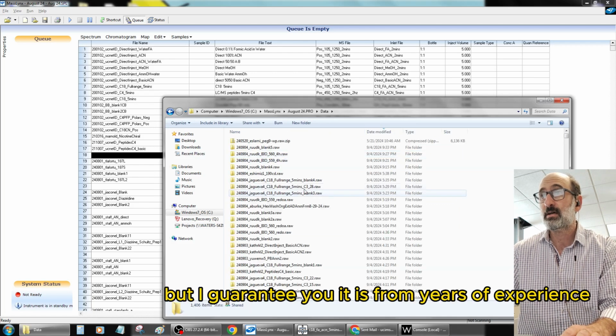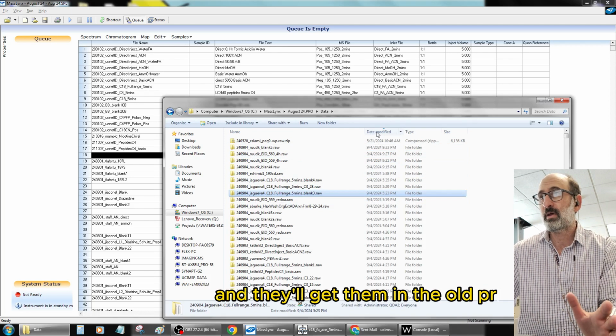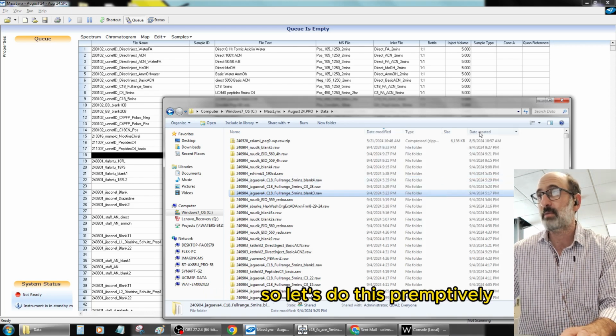This seems unnecessarily complicated to do this type of stuff, but I guarantee you it is, from years of experience. Otherwise, people will just save stuff from this month in the old project, and we don't know, and it'll be back and forth, and then everyone will be very confused. So I just do this preemptively.